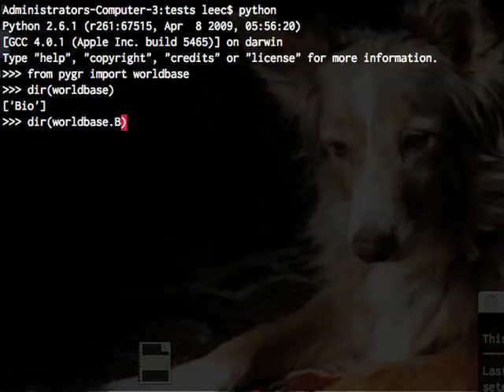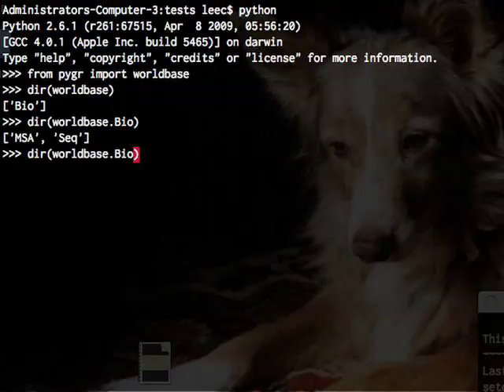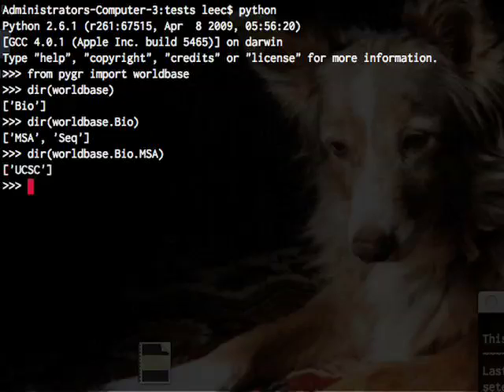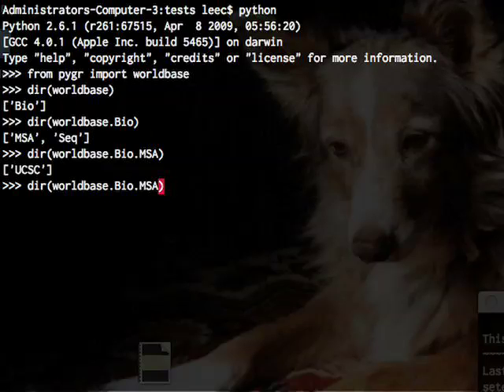So we see a bio inside that, we see multiple sequence alignment and sequence information inside this namespace produced by a vendor called UC Santa Cruz.